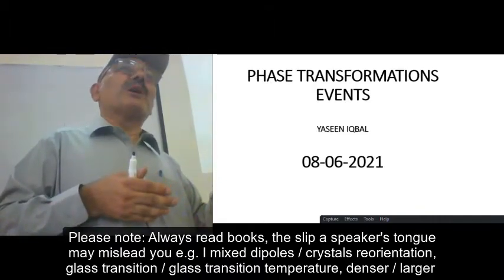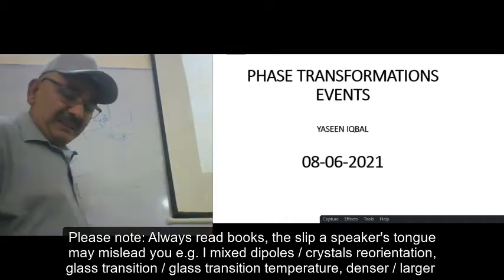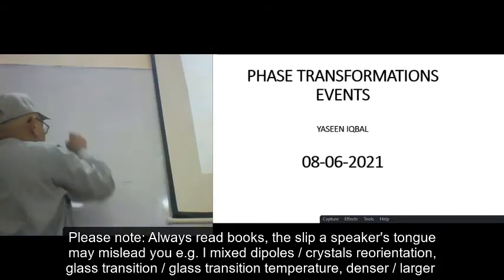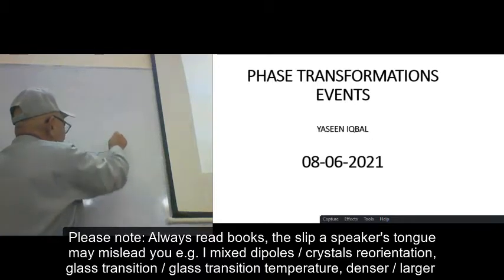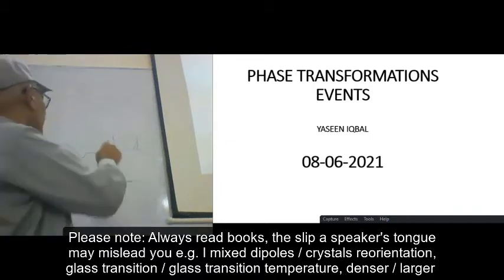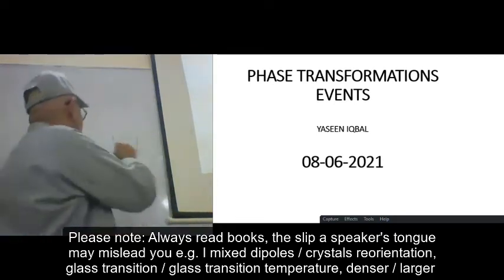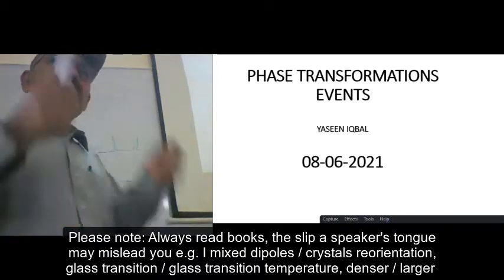So how useful is the differential thermal analysis? Secondly, the material forms, say, this. It is indicative of glass transition. It transforms into glass. It is called Tg. Remember the terminologies.